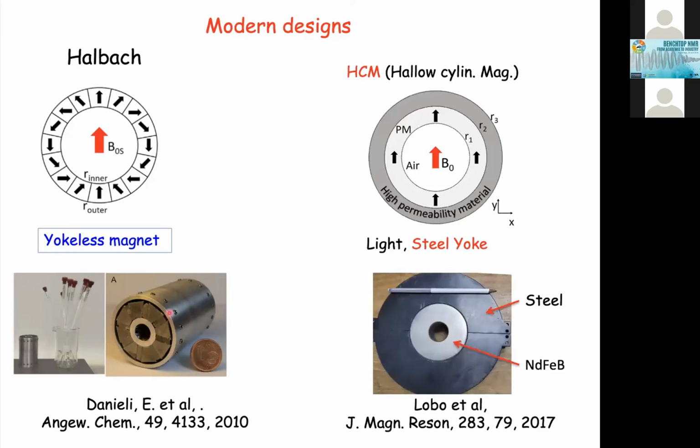A few years ago, we developed another type of magnet. Halbach sometimes is not easy to assemble, to have a very good homogeneity inside here, for example. There are a lot of tricks, not an easy thing.